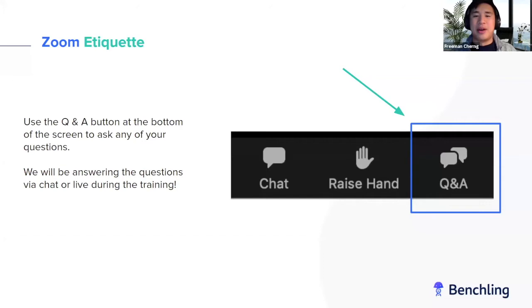We'd love to hear about how you or your team could use Benchling. This information could also help you learn about other various ways to use Benchling with your peers. So we'll be giving a minute or so for you all to send a response to the Zoom polls, which will be in the form of a multiple choice question that will pop up on Zoom.